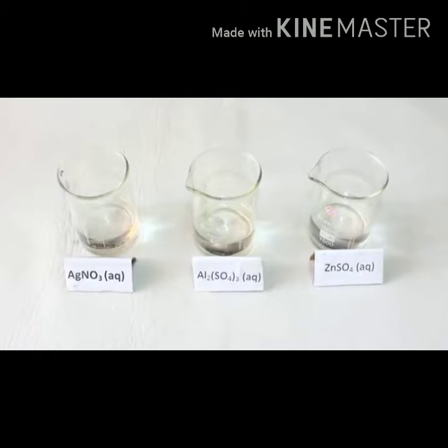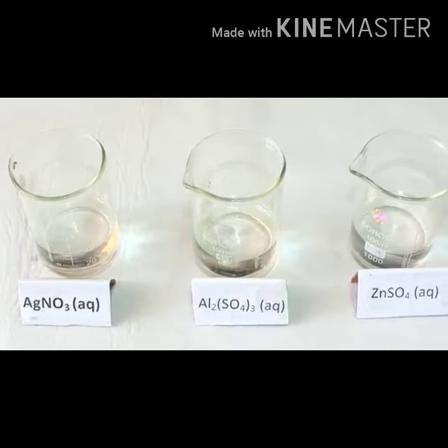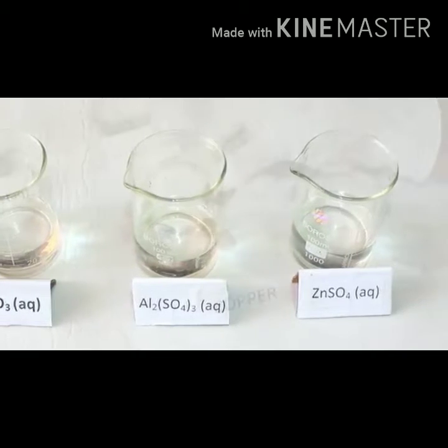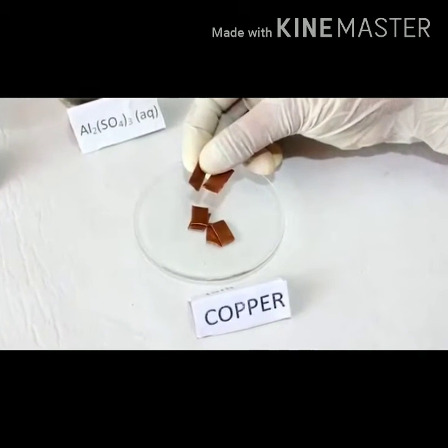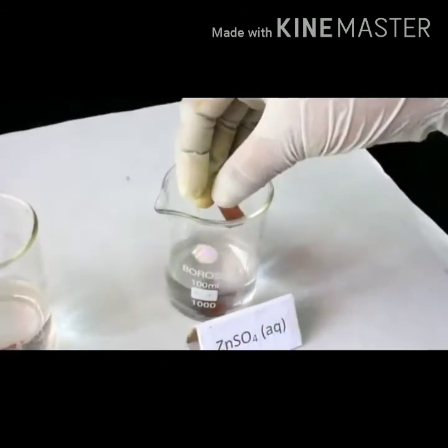To test the reactivity of copper in solutions of silver nitrate, aluminium sulfate and zinc sulfate, add pieces of copper into the silver nitrate, aluminium sulfate and zinc sulfate solutions.